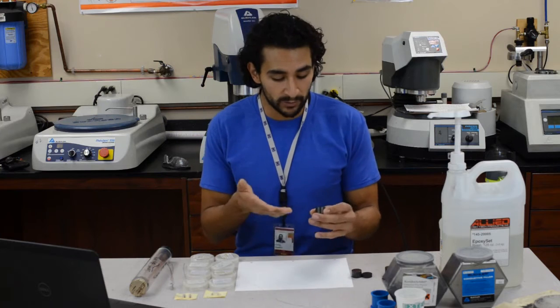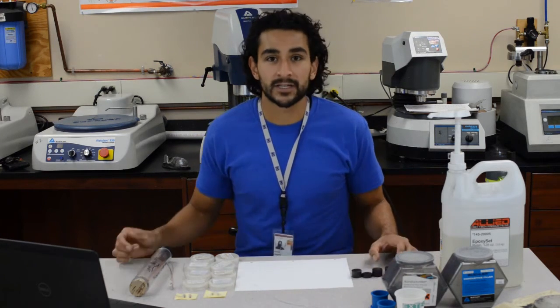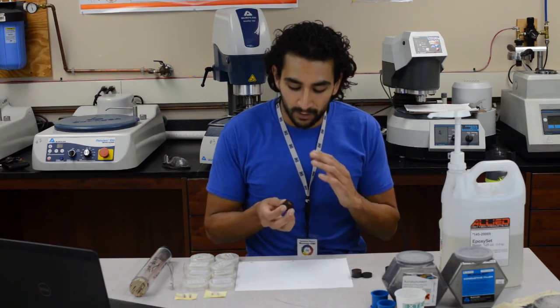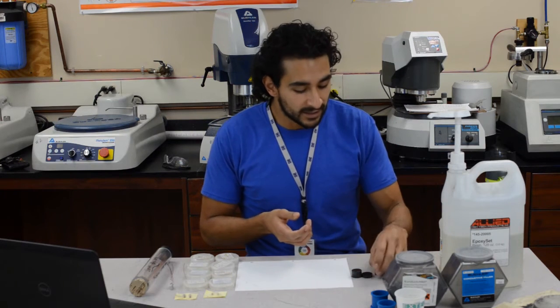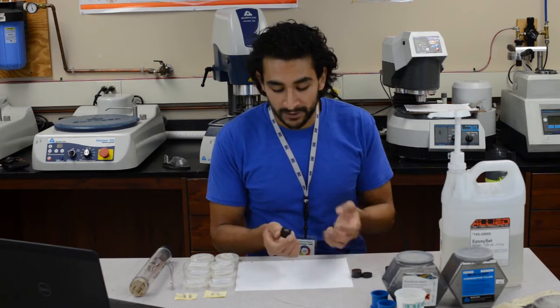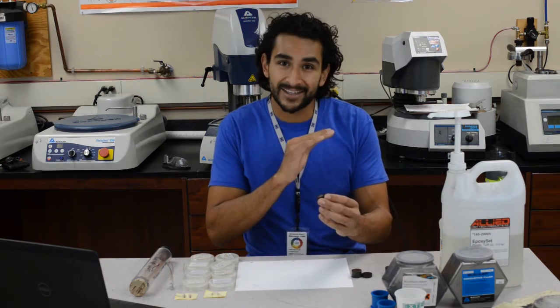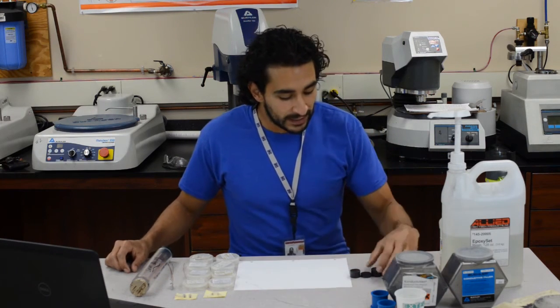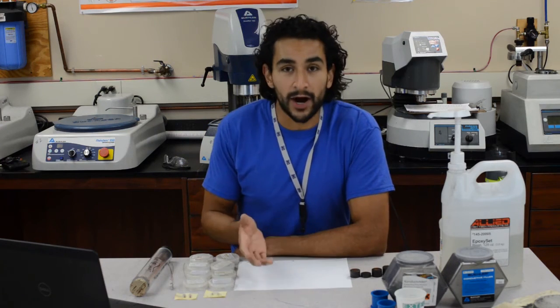You can find out what components your sample is made of and how much of each component is in there. But whatever it is that you're doing with your sample, the most important thing is that you want it to be as close to a perfect cut as you can get it. That means you don't want any foreign particles in your sample, you don't want any scratches, any smudges, nothing. You just want your sample in a perfect cross-section. But before we jump into how to get a really nice cross-section, I wanted to talk about why.